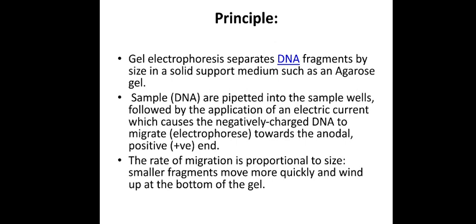That means if you allow a mixture of DNA fragments to move under an applied electric field, at a given voltage, for a given pH, and for a given time, for example, half an hour, you are allowing the molecules to run for half an hour. Running means you are allowing the molecules to move. So this is called running. So what happens if you allow them to move for a specific time, for half an hour for example?